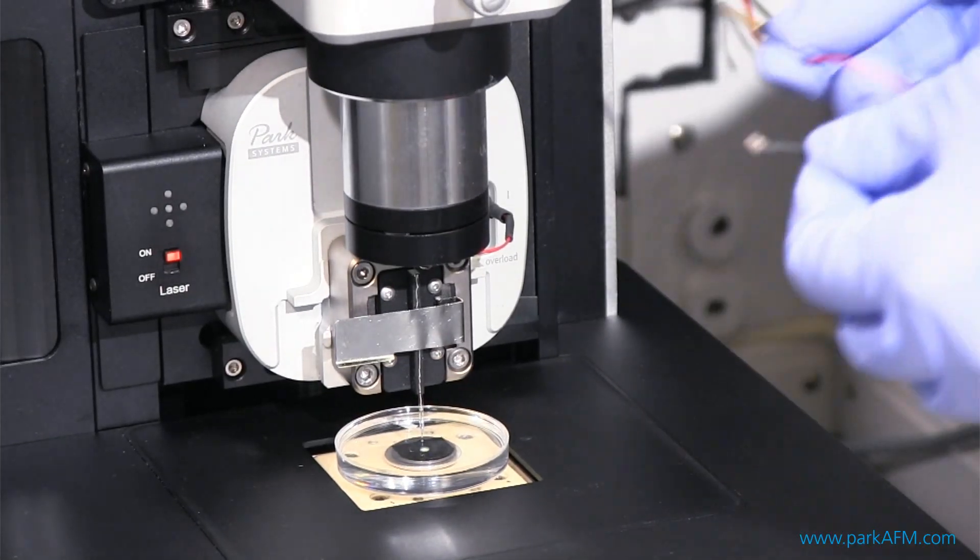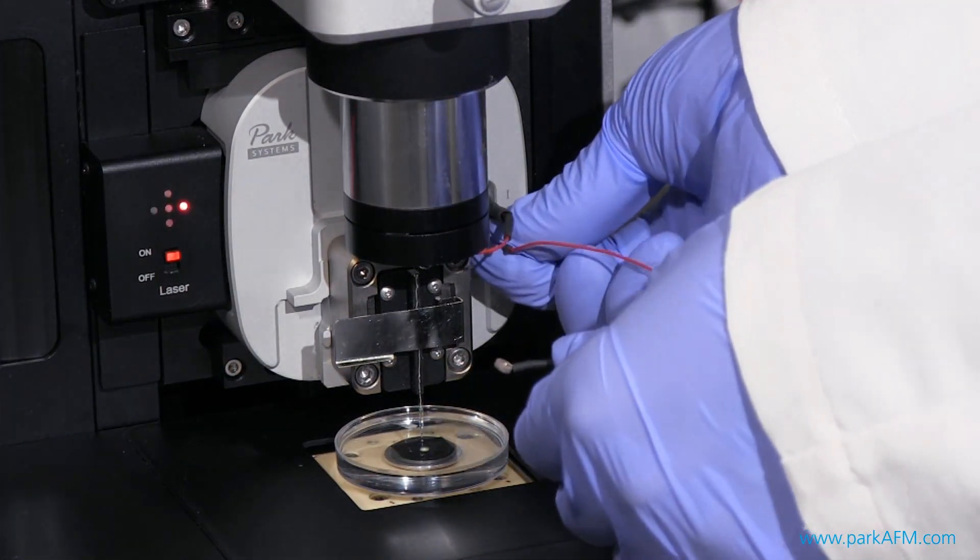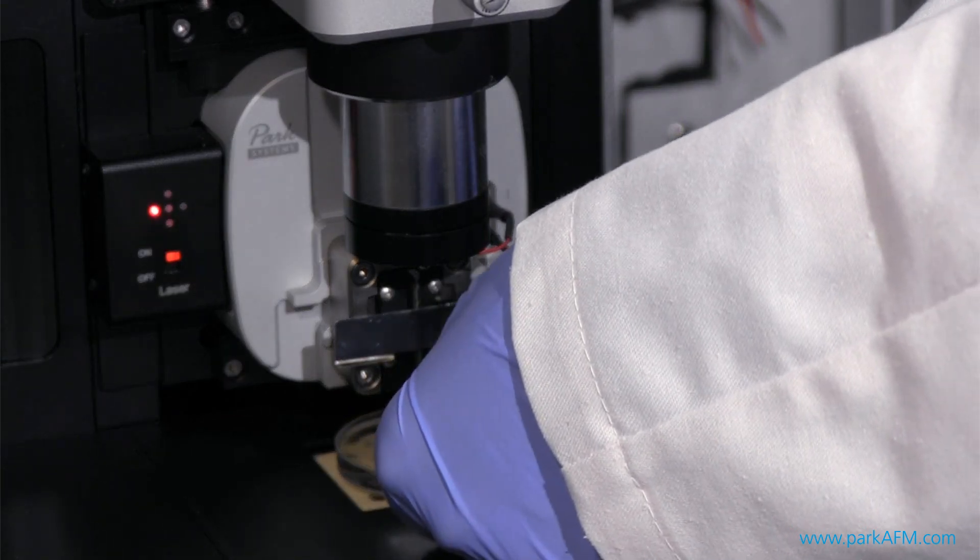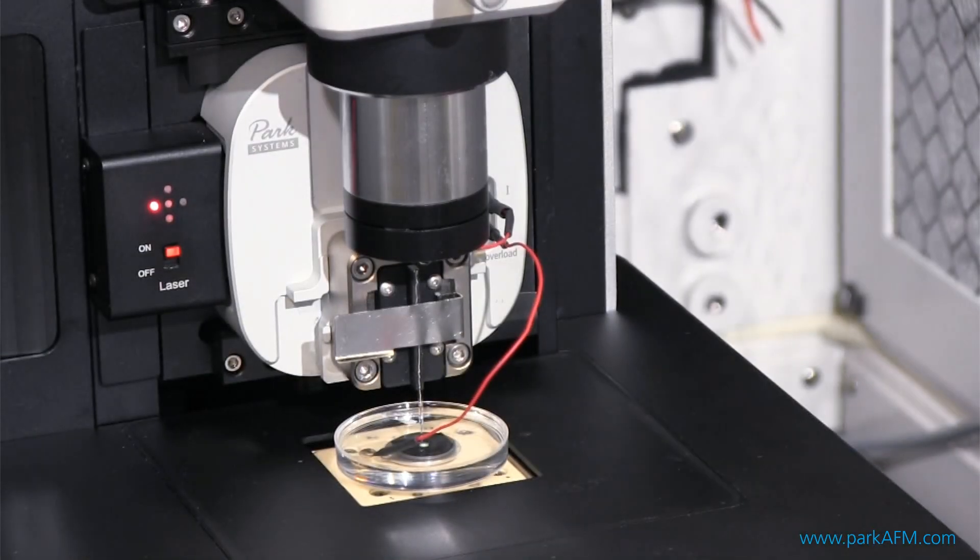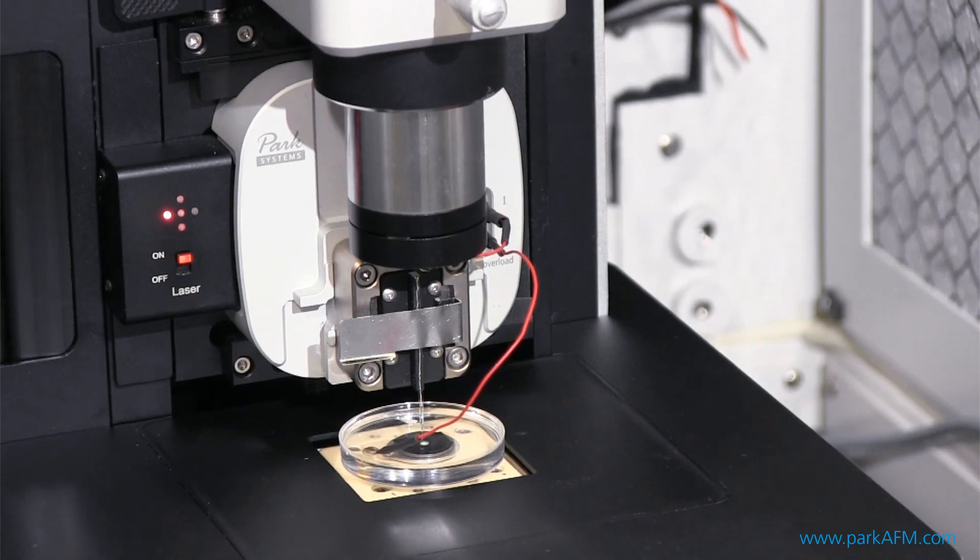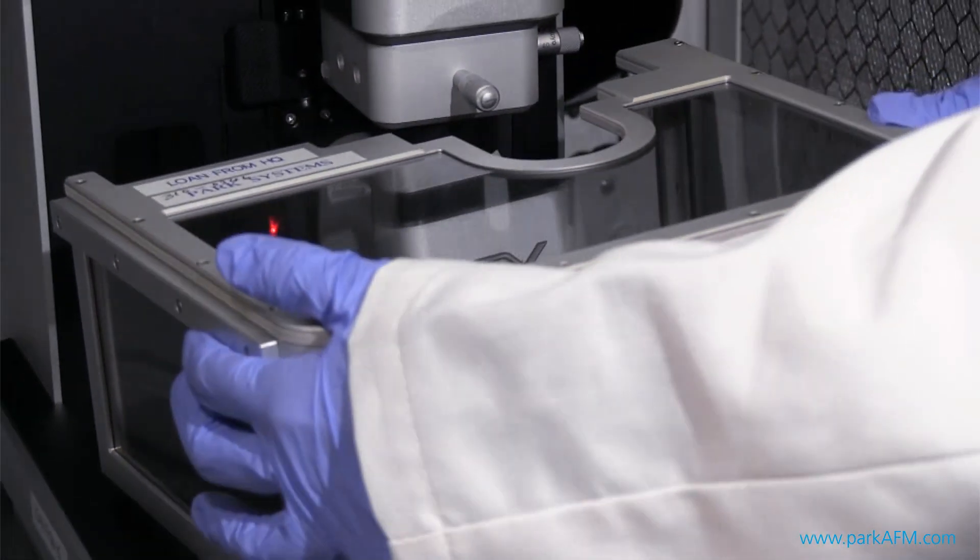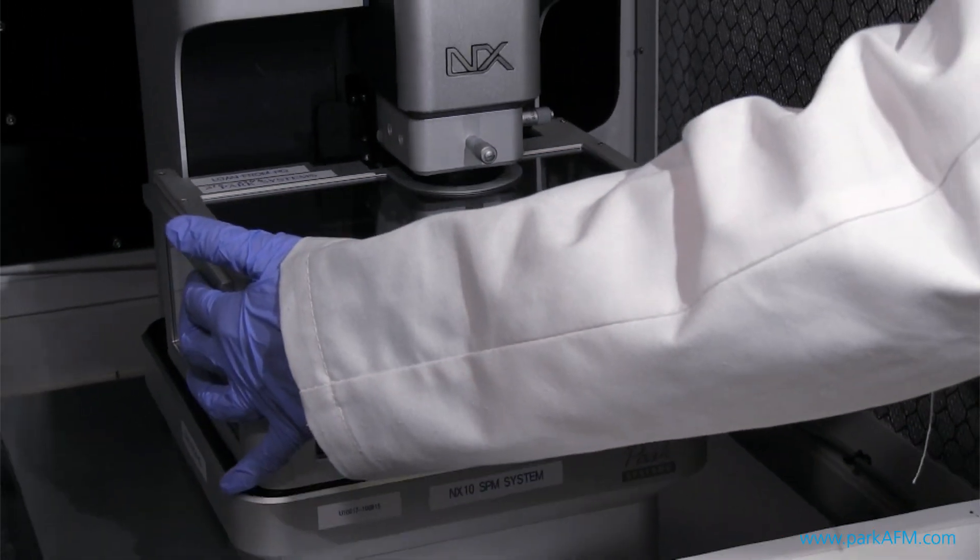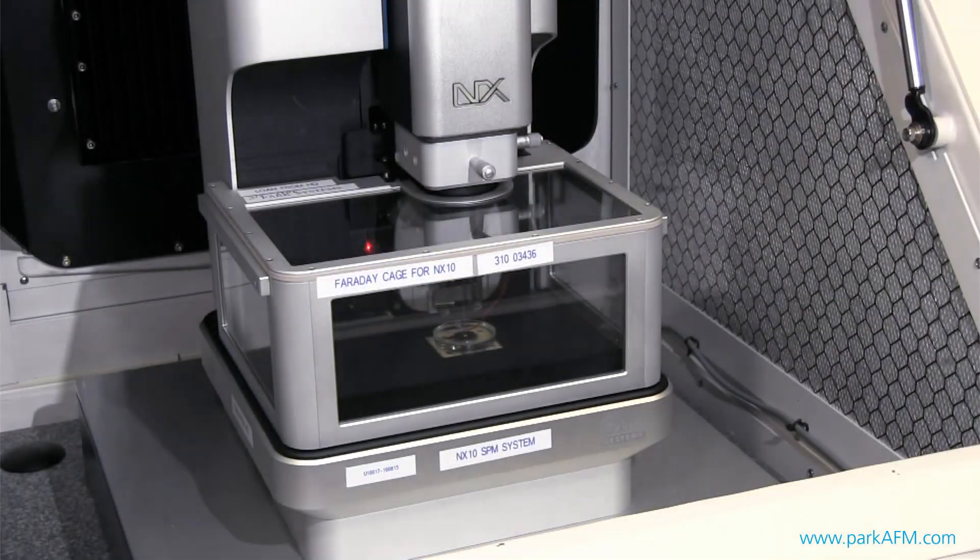Next, we connect the sample with the head using the bath electrode. Lastly, let's put the Faraday cage back in place to prevent electrostatic interference from affecting system performance.